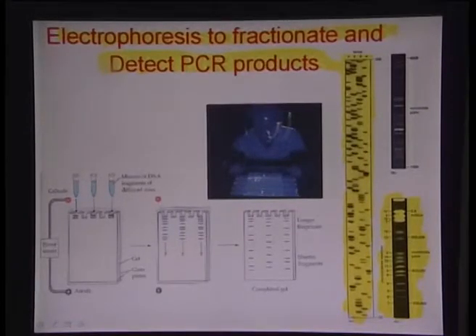So there also you are using gel electrophoresis to find out information about the sequence, coupled with a characteristic fluorescence for the type of molecule, A, T, G, or C. We will be talking about this process in one of the later lectures in great detail. It's called Sanger's reaction, and this is one of the fundamental principles of gene sequencing.